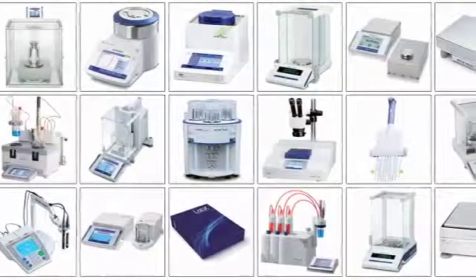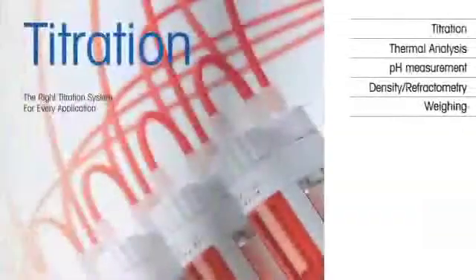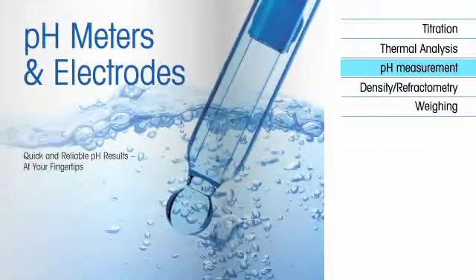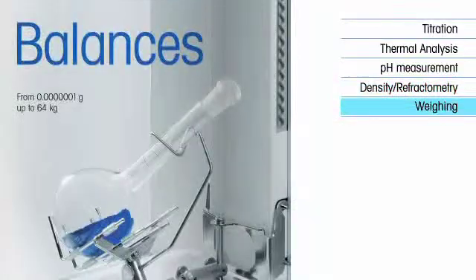Mettler Toledo has innovative laboratory products for a wide range of applications including titration, thermal analysis, pH measurement, density refractometry, and weighing.